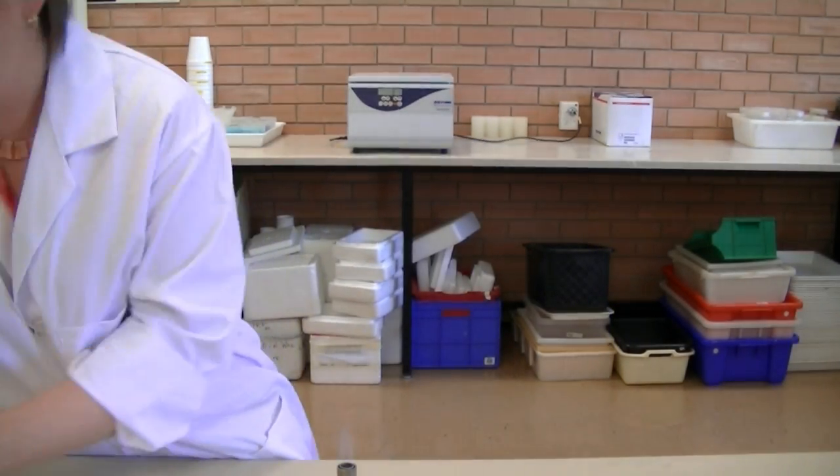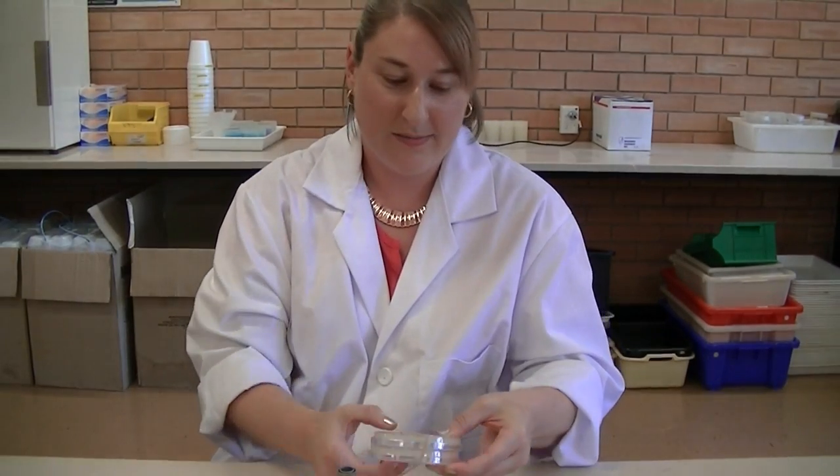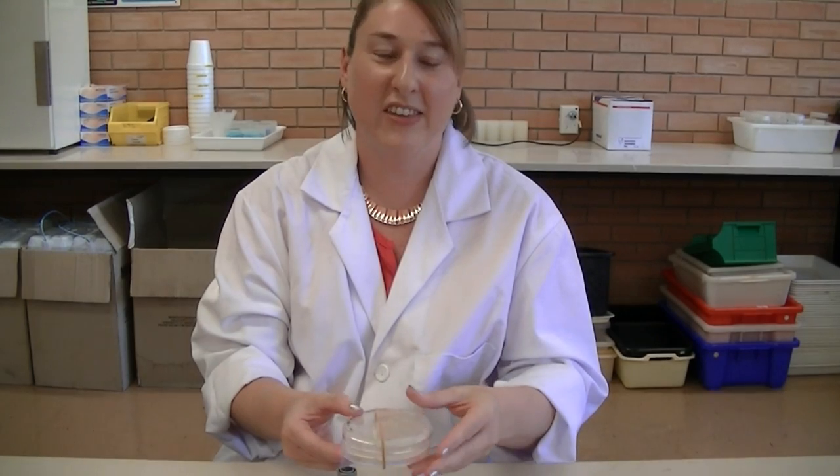Rubber band the two plates together with a single rubber band to make sure that your samples stay together in the incubator. Then place this into the appropriate box for incubation.